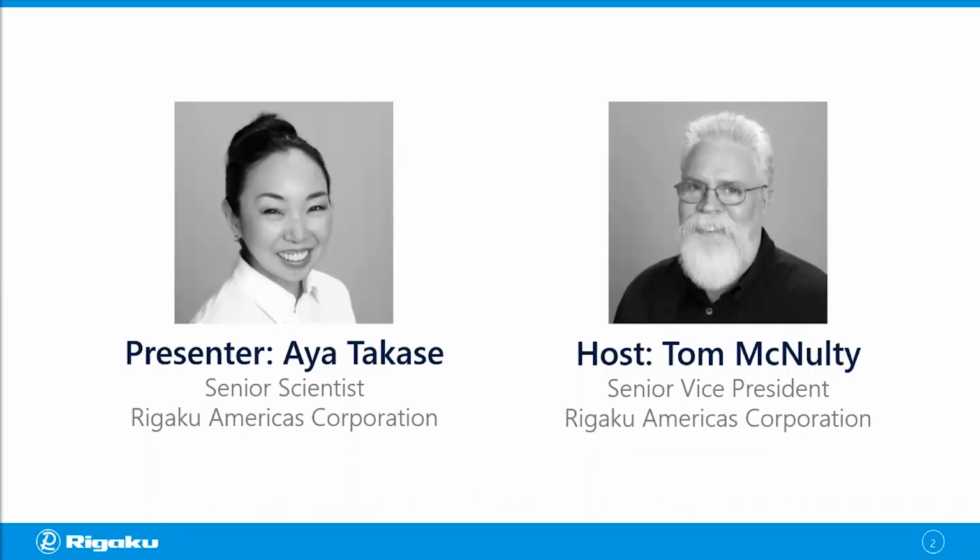Thank you all for attending Rigaku's webinar series, X-ray Computed Tomography for Material Science. This is our third segment, Food and Pharmaceutical Applications. It will focus on the principles, techniques, and research used to develop optimized foods and pharmaceutical science applications.